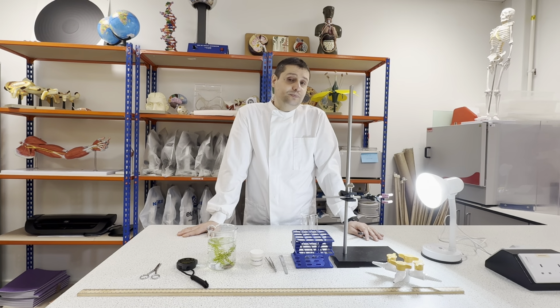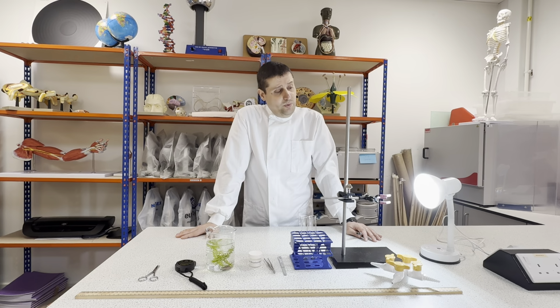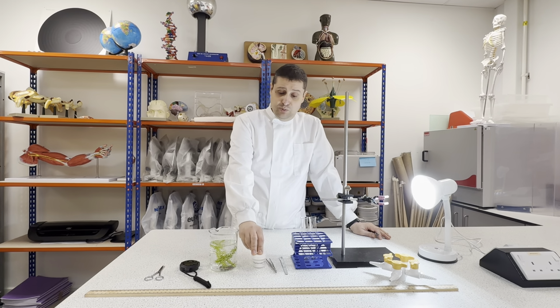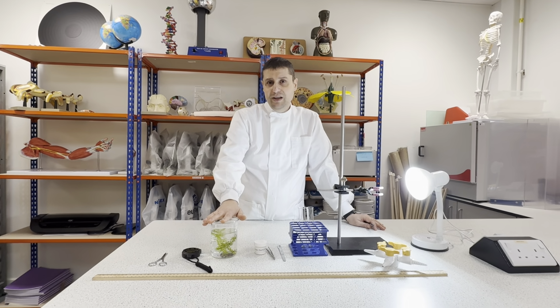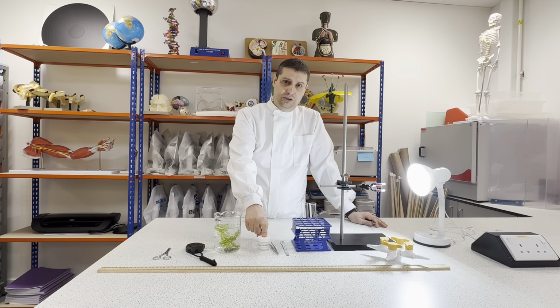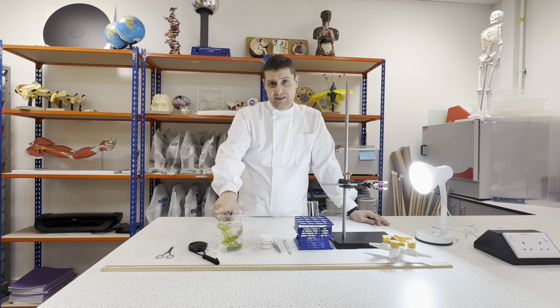For this practical, we're measuring the rate of photosynthesis. So in order to have photosynthesis, we need a source of light, that will be my lamp. I need CO2, that will be increased. We have CO2 diluted in the water already, but I need more to increase the rate. So I'm adding sodium bicarbonate to this water. And obviously, I need the plant, the chlorophyll, during the process.